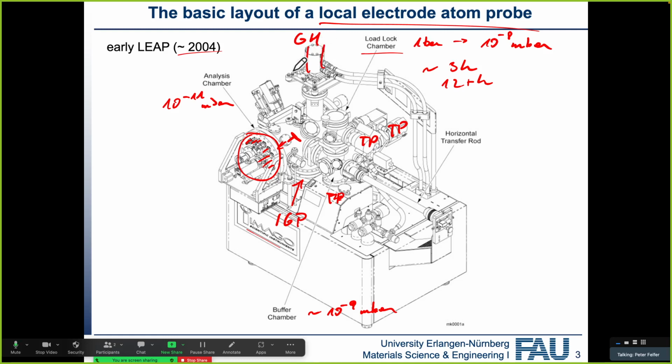The bottom-out temperature of these systems is typically around 4 to 10 Kelvin or 2 to 10 Kelvin. But due to losses in transmission of the cooling power, we don't get down to those levels. We get down to about 20 Kelvin, which for atom probe is more than good enough. And there was a study not long ago where people tried to go even lower, and they found out that nothing interesting really happens below 20 Kelvin.